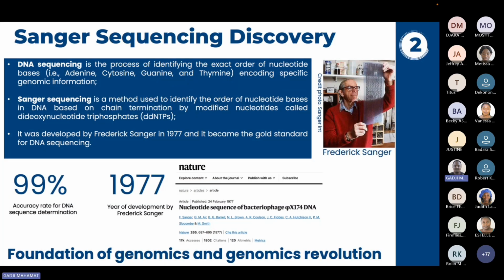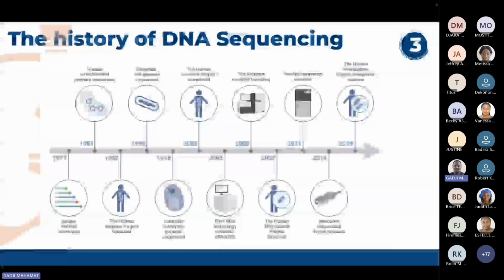There has been significant progress since the discovery of Sanger sequencing, leading to the sequencing of key organisms, including the human mitochondrial genome, as well as the human genome in 13 years, between 1990 and 2003. A task that can now be done using next generation sequencers, such as the NovaSeq 6000, in just 3 days.